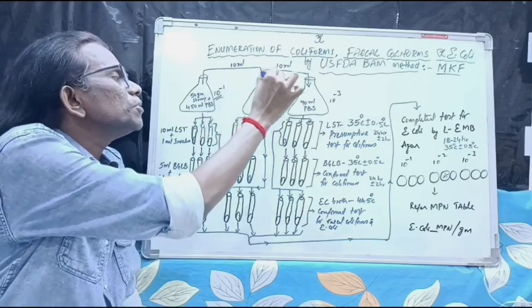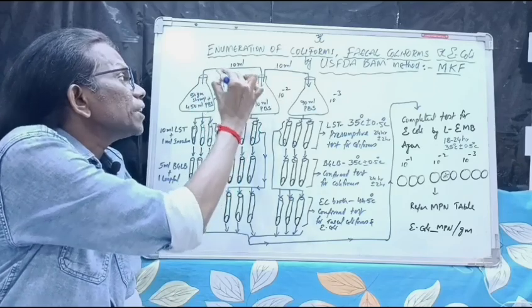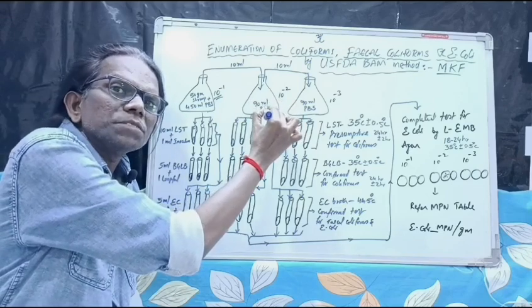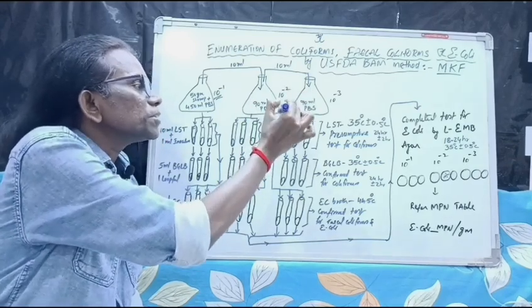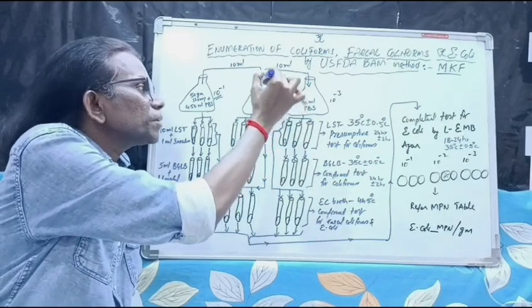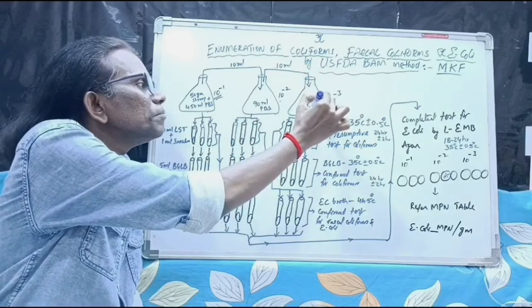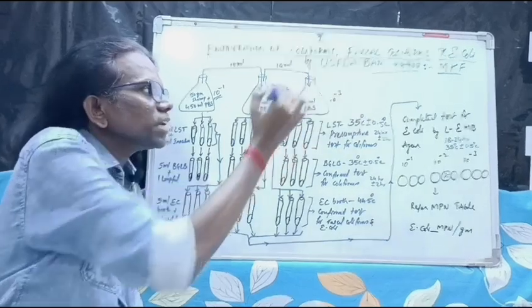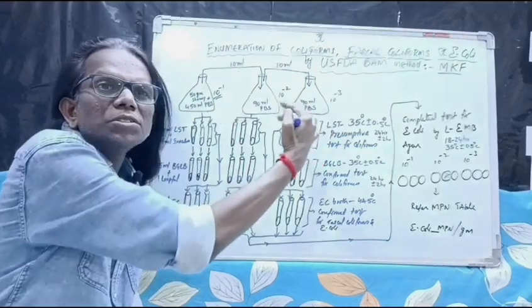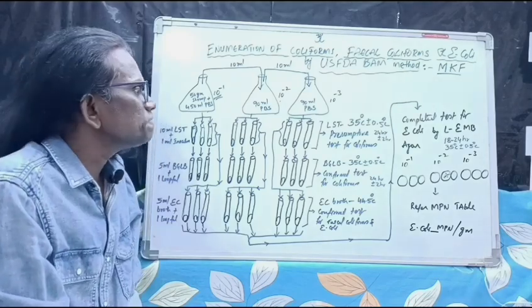Then make decimal dilutions up to 3 dilutions. Take 10 ml of the 10 to the power of -1 dilution and transfer it to 90 ml of PBS solution. This gives rise to the 10 to the power of -2 dilution. Shake it 25 times and again pick 10 ml of the 10 to the power of -2 dilution and transfer it to 90 ml of PBS solution. This gives rise to the 10 to the power of -3 dilution. This is how we do the decimal dilutions. A minimum of 3 dilutions is required for performing the coliforms test by the MPN method.